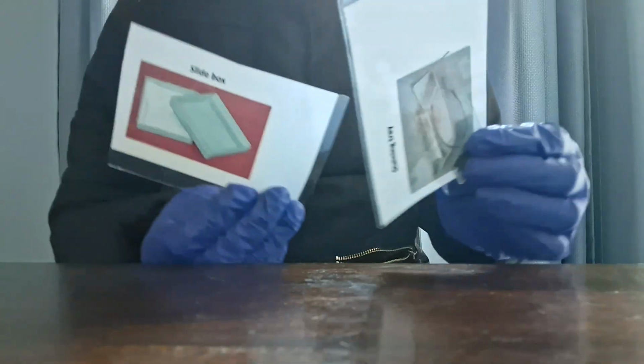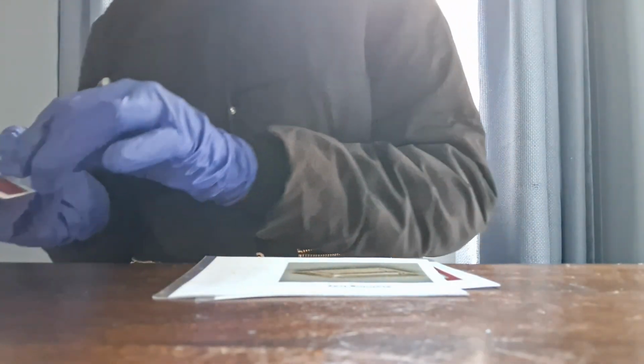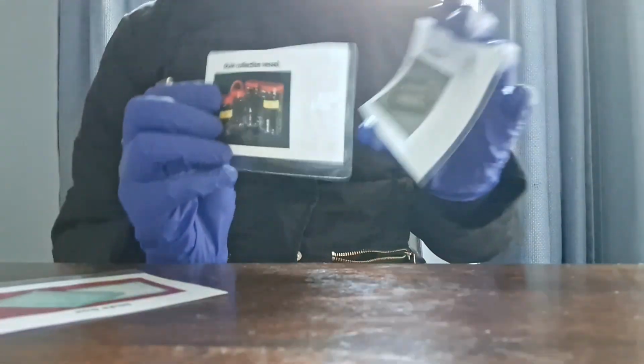You can put it in your slide box, or you can put it on a microscope from scanning to the highest power, to the oil immersion, for viewing. After it's all done, we will then pick this up and put it in the sharps container, and then we pour the staining tray water into the stain collection vessel here.